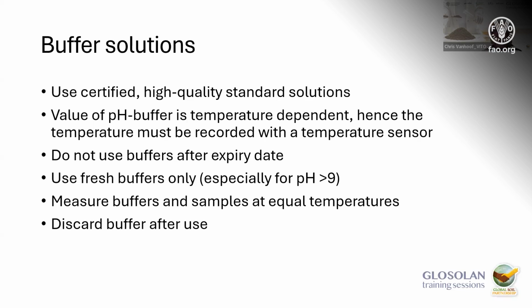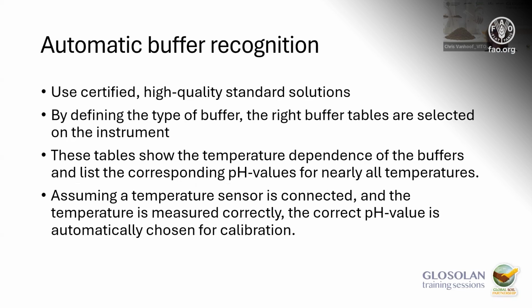It's also encouraged to measure the buffers and the samples at equal temperatures, because then you have the same effects playing a role during the measurement. And if you have used the buffer for a measurement, throw it away and don't use it again or keep it like that, because the buffer value can change over time.